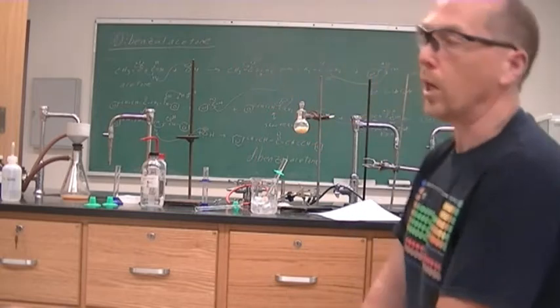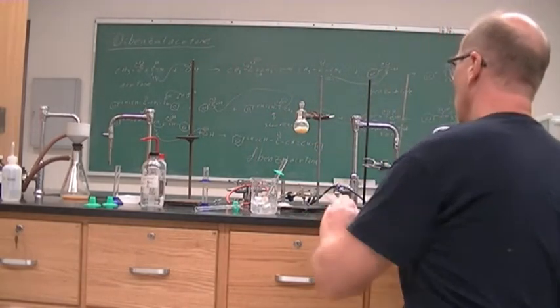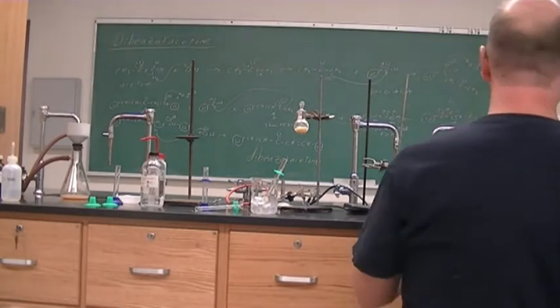So now we have our product, and it is not a pure crystalline product, so that's why we're going to do a recrystallization. Alright, and so we're going to use ethyl acetate.